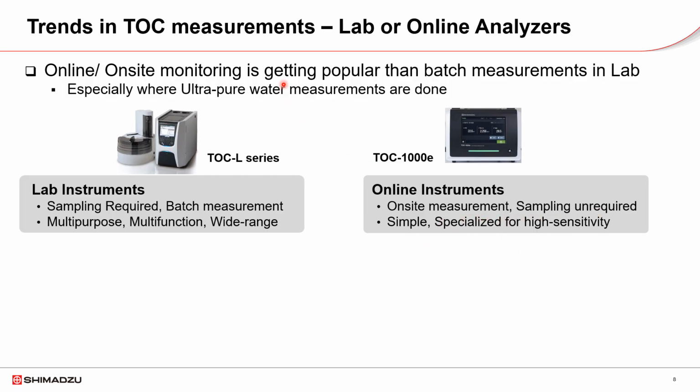The trend is towards utilizing online or on-site monitoring rather than relying on batch measurements in a lab. This is particularly evident in the context of measuring ultra-pure water.